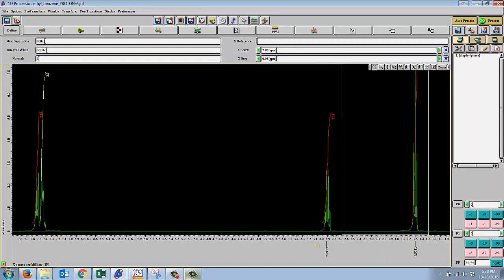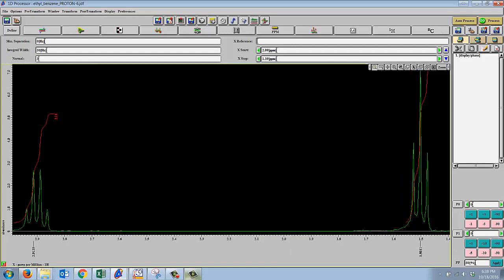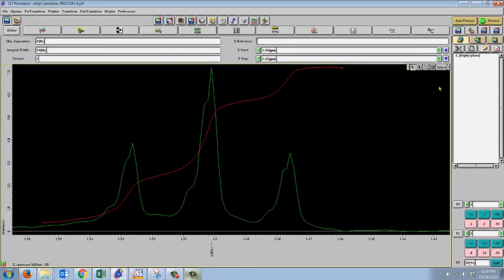Another thing we can do is, if you look back at your handout and look at the J coupling, we can actually figure out what that J coupling is. Look back at the handout that you did in class and notice that there was a distance between each of the different types of peaks, and that tells us something about these peaks. Oftentimes we're going to look at J coupling, which is just a way of looking at the interactions, what set of protons are related to other protons. The way to do that is we have to select 2 different peaks on your multiplicity.